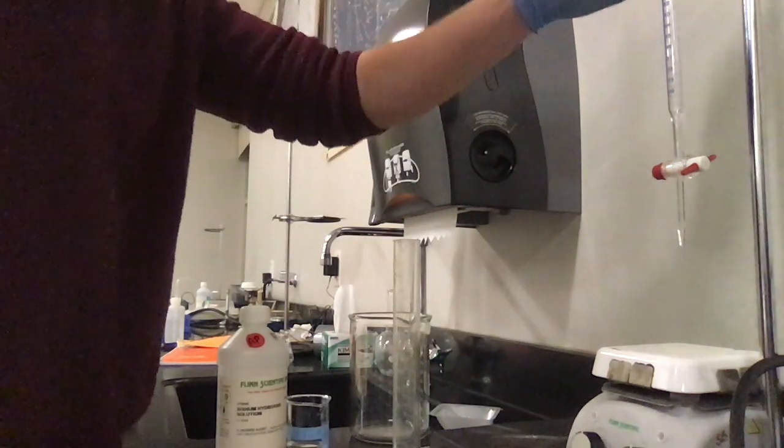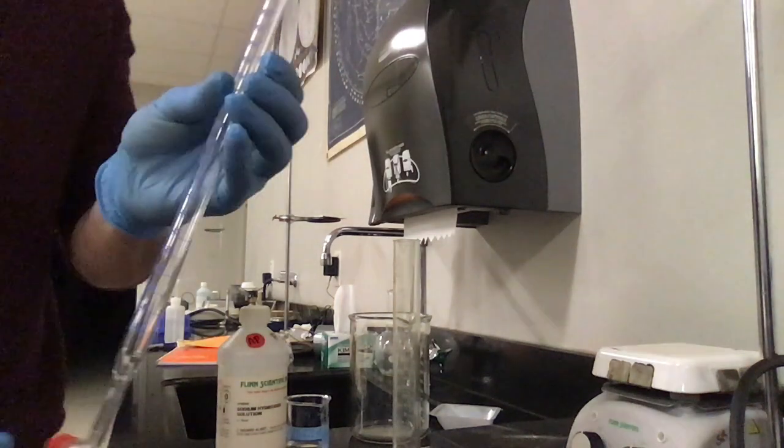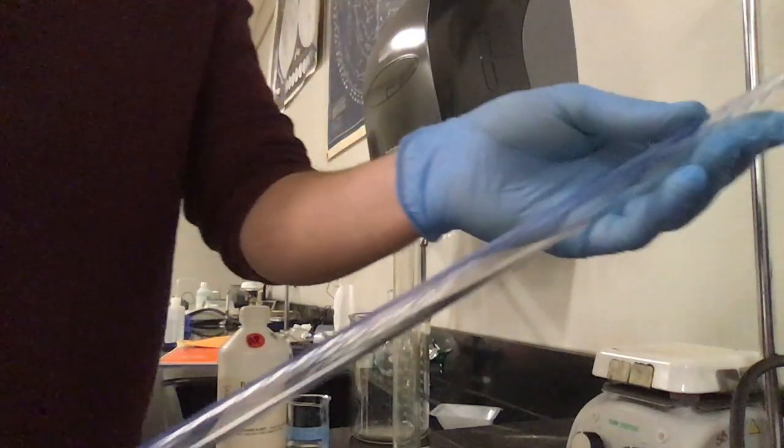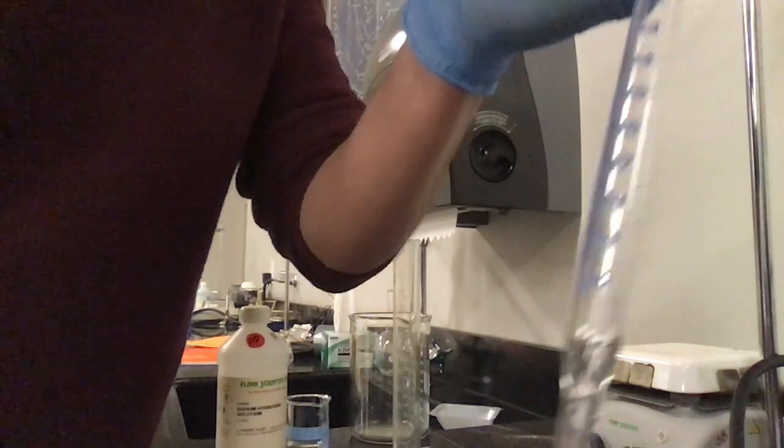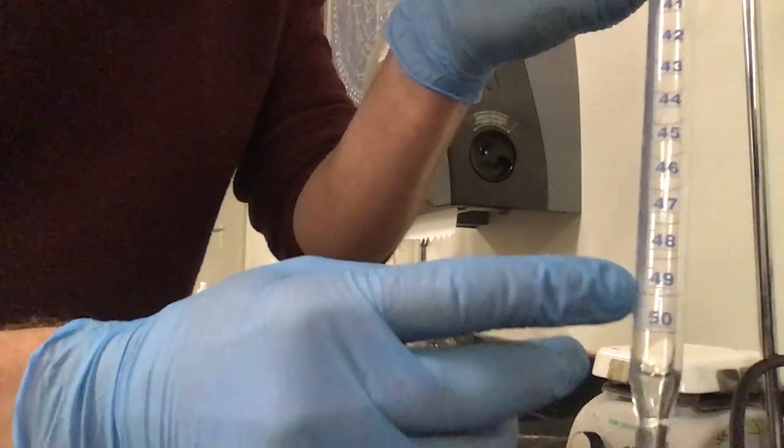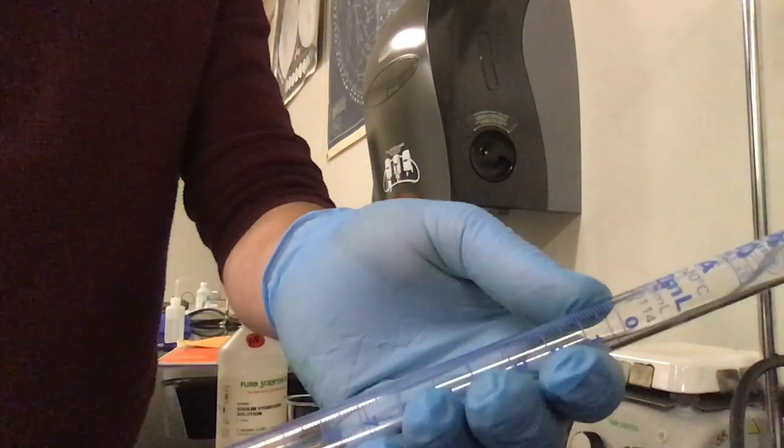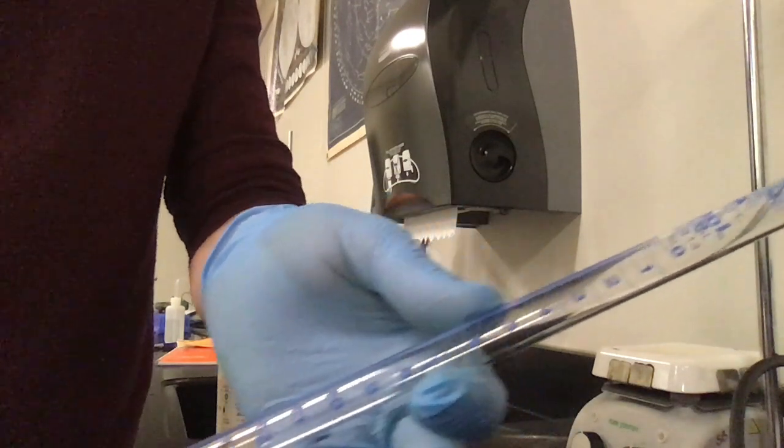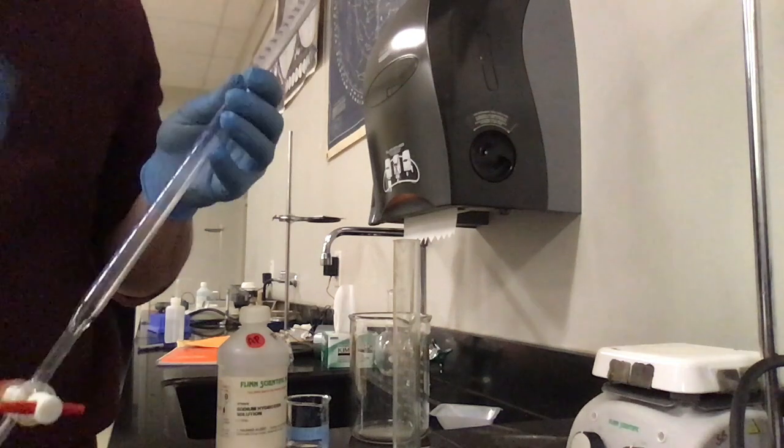Now let's talk about the burette. The burette is something that you use in all titrations. Titration is a very common procedure in chemistry. You'll see that there are graduations on this. They are decreasing. So if we start here at 50, they decrease as you go up.